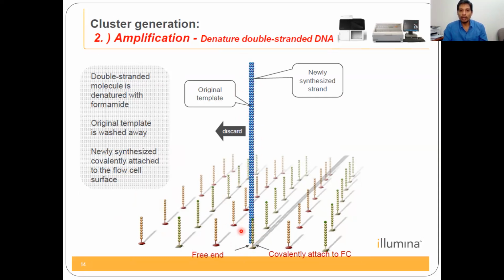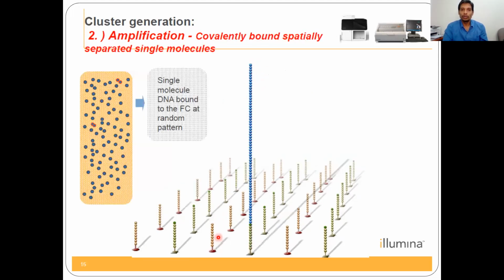The complementary sequence of these adapters is the green color one, and the adapter on the other side should be complementary to the other primer, isn't it? So the newly synthesized strand has a known sequence, another adapter, which is complementary to either the orange or red color primer.